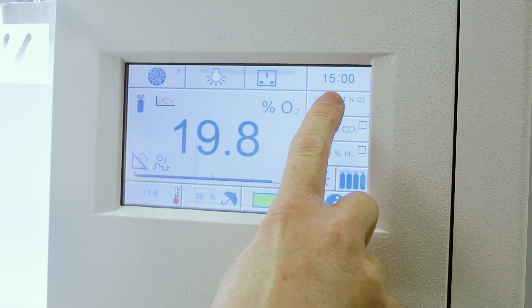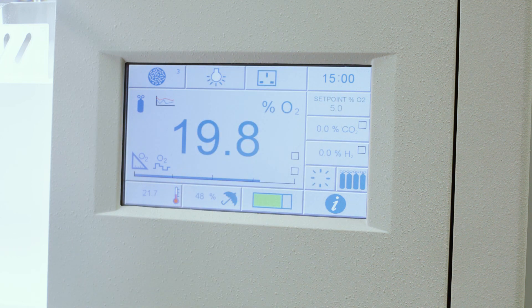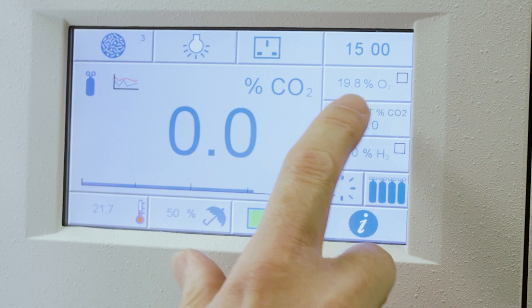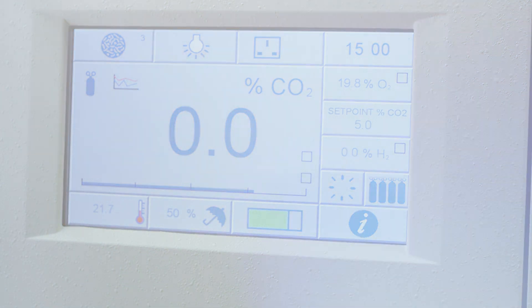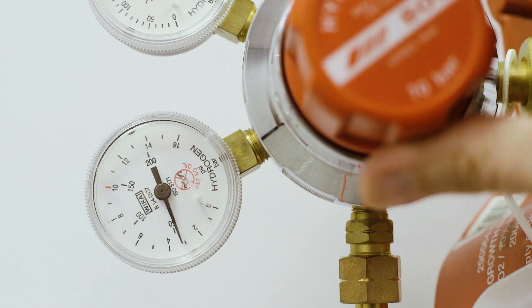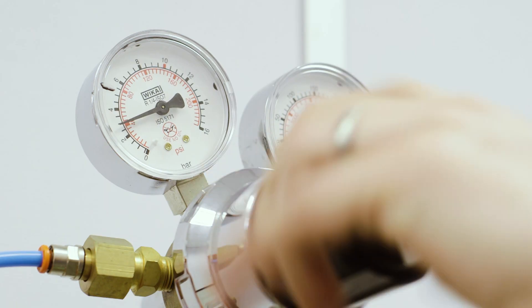Our microaerobic workstations control oxygen, CO2 and hydrogen via gas sensing technology. Up to four gases, nitrogen, carbon dioxide, air and a 10% hydrogen, 90% nitrogen mix can be combined within safe and varying ratios to provide the most appropriate incubation atmosphere for your organisms.